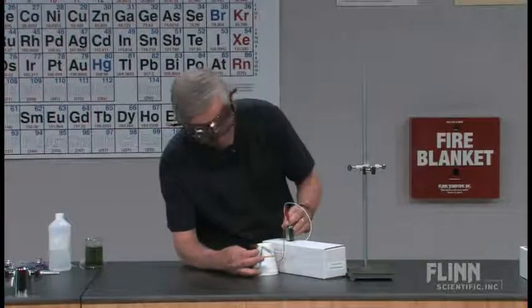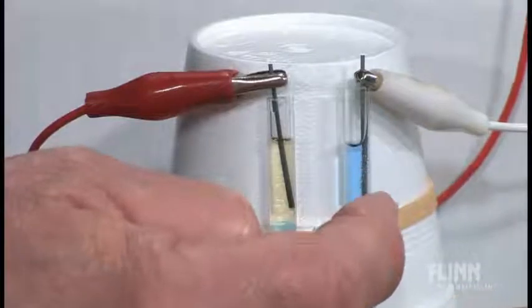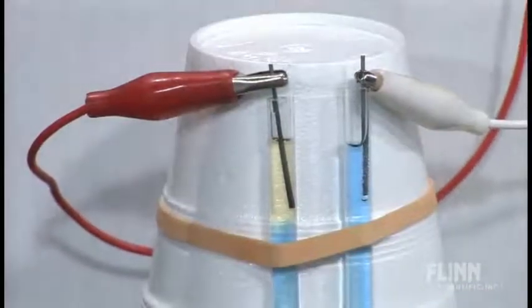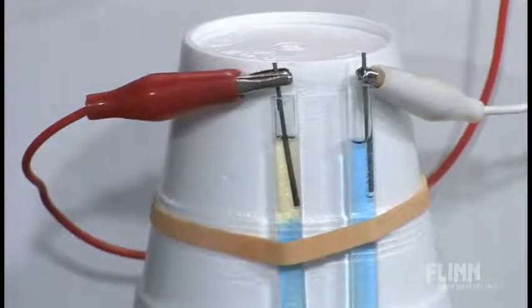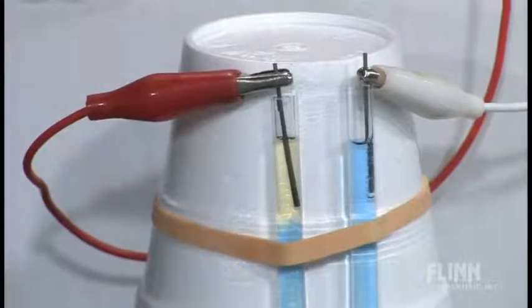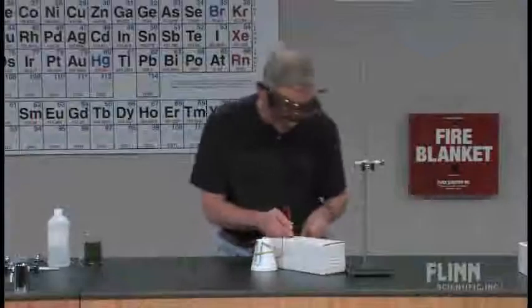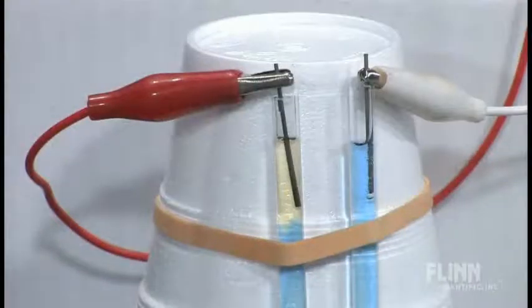This side turned blue. Acid or base? Base, okay. And that is the negative electrode. Emphasize that a little bit, put it back on, or not. The positive side turned yellow. That's acid.